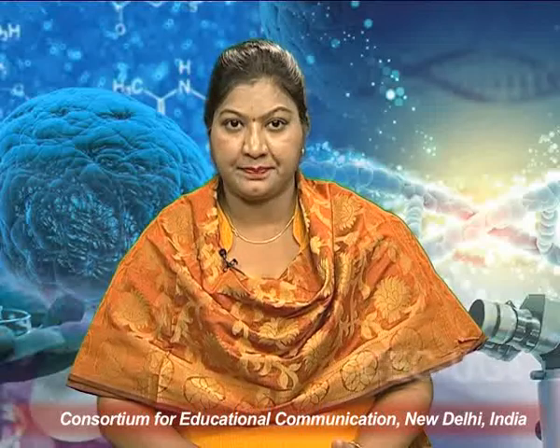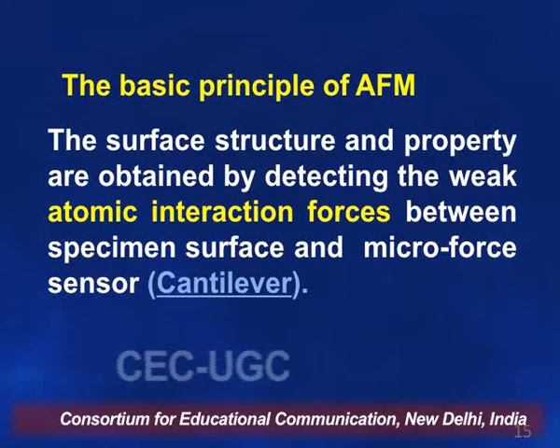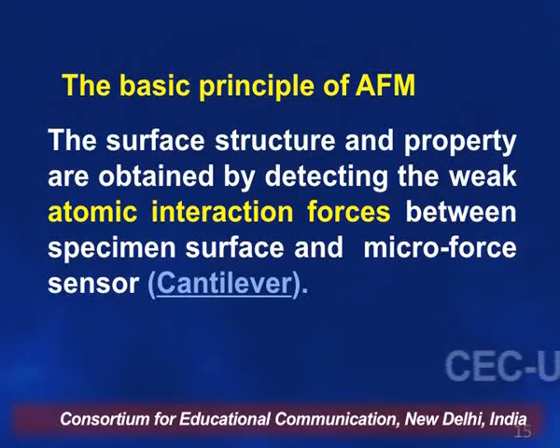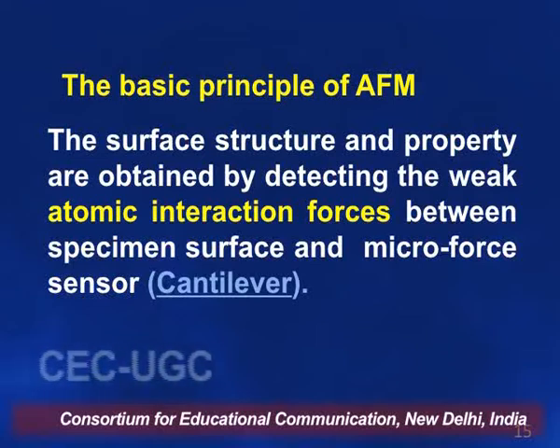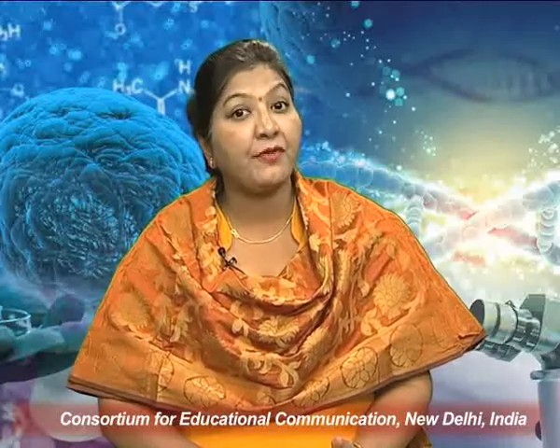So AFM is used to get surface imaging, and the surface texture and properties are obtained by detecting the weak atomic interaction forces between the specimen surface and the microforce sensor. What is this microforce sensor? This microforce sensor is basically a tip which is attached to the cantilever.